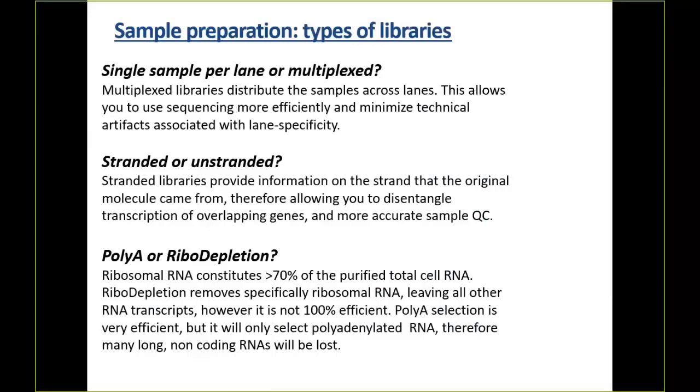And when it breaks somewhere during processing and you're doing a poly-A pull down, you lose everything 5' relative to the break. So what I saw when I looked at their gene and I was trying to look at the distribution of lengths, I didn't see anything that looked like it was jumping directly from the beginning to the end. I just saw this nice distribution of where the breakages were happening. This was the main thing they wanted to look at in their study, and I had to basically tell them at the end that your $20,000 massive sequencing study for the main thing you wanted to discover is uninterpretable.